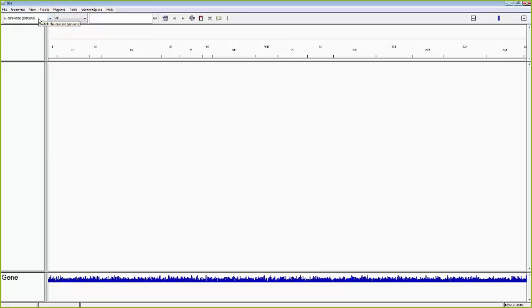Right now, I have loaded and started IGV with that SACSER3 genome already loaded. If you're using human data, you might want to use HG19 or HG18, but I'm using yeast data, so I'm going to be using the Saccharomyces cerevisiae genome. If you have another data type, you can click on More and use a different genome.